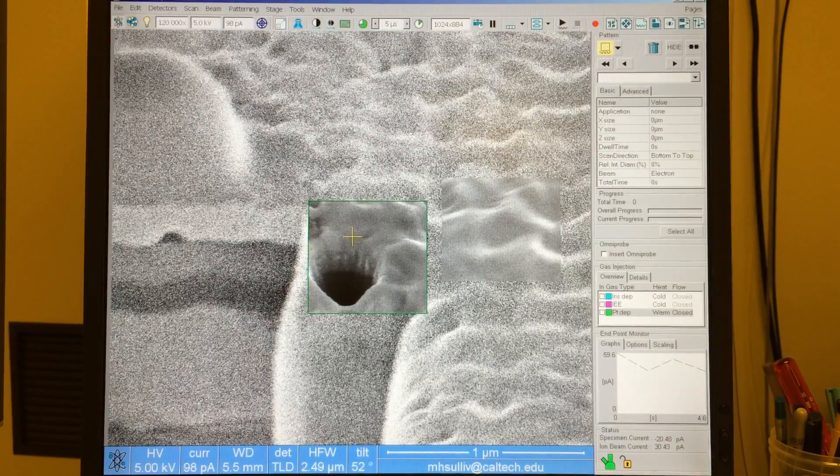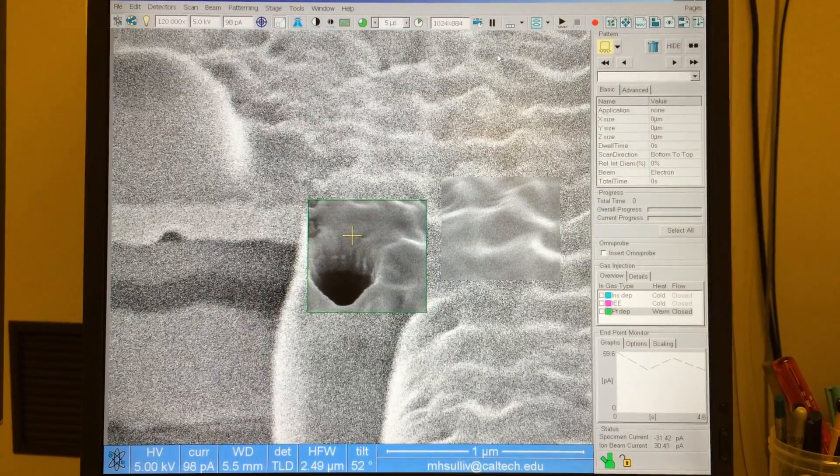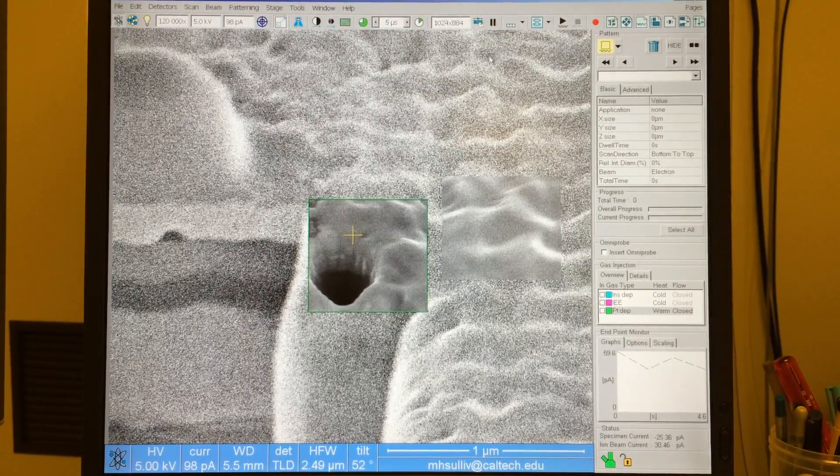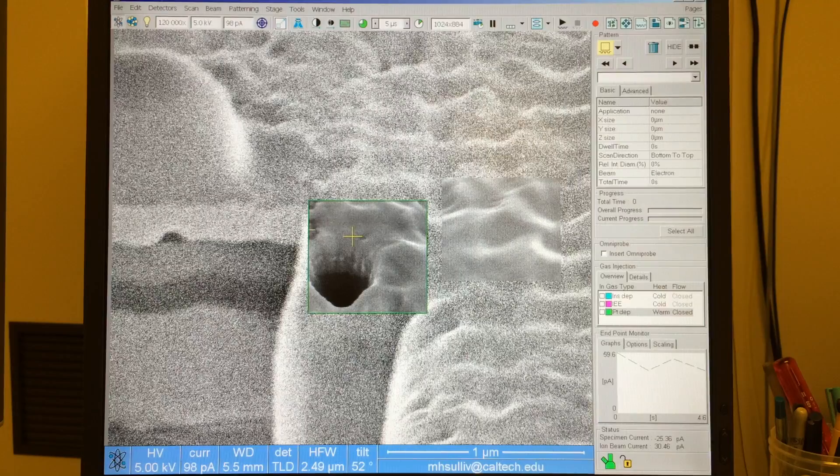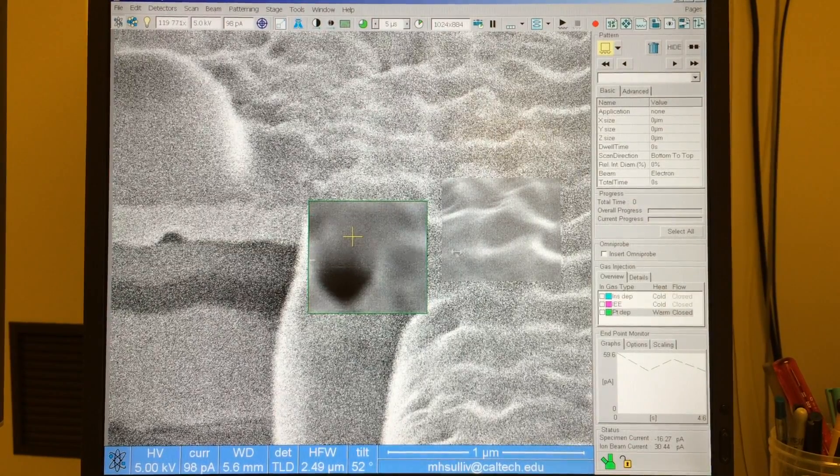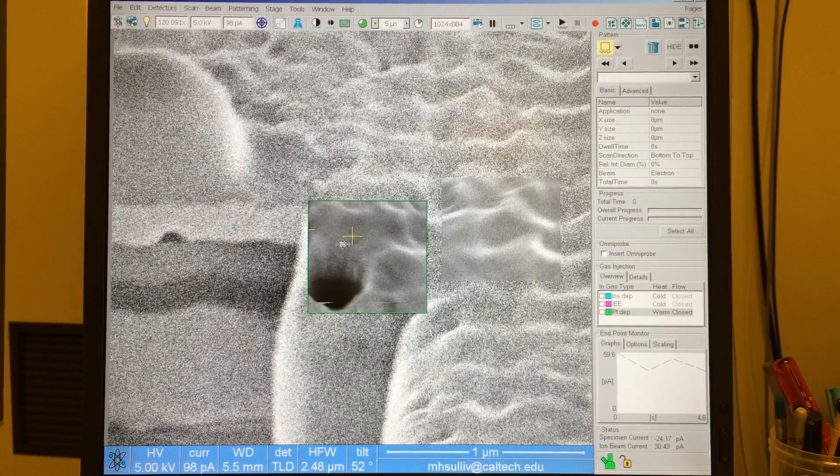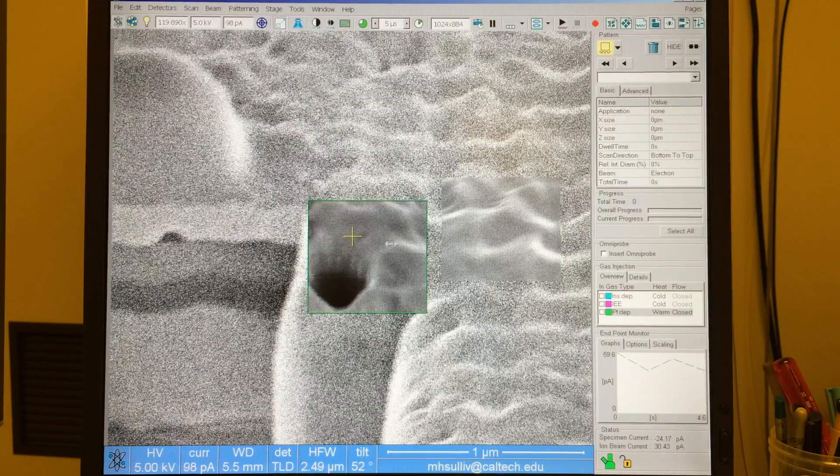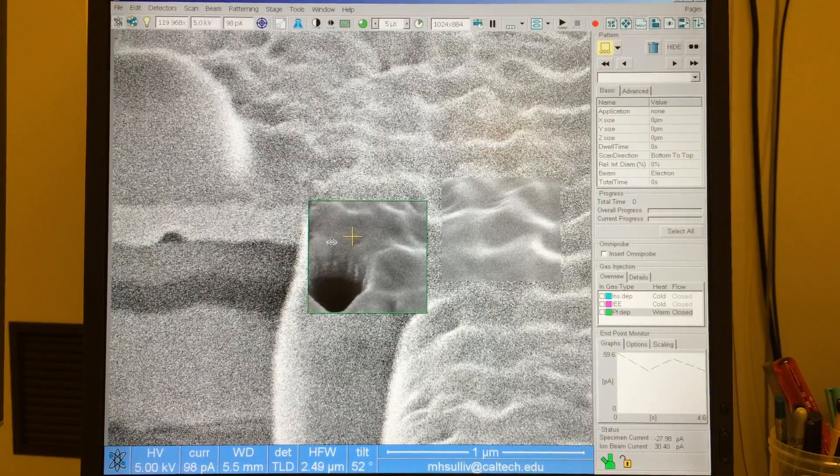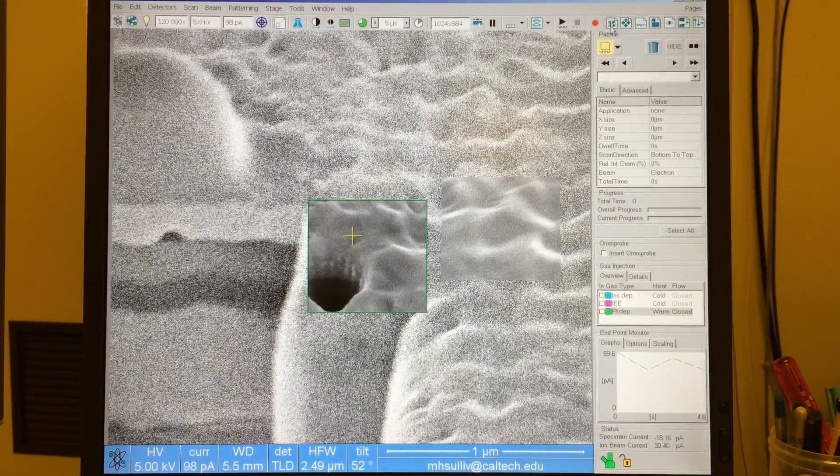And then what I really want to do, anytime I'm in immersion mode, I know that I'm going to have a bad lens alignment. I can tell that because when I change the focus, my image is shifting on the screen. So that tells me I need to do a lens alignment.